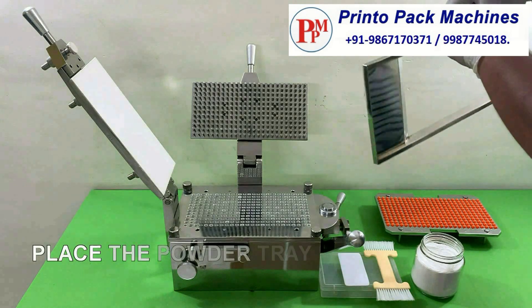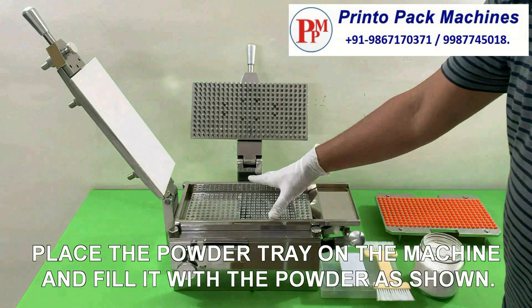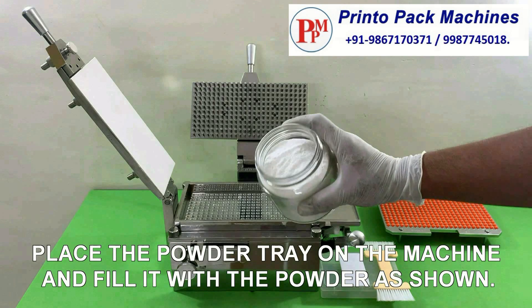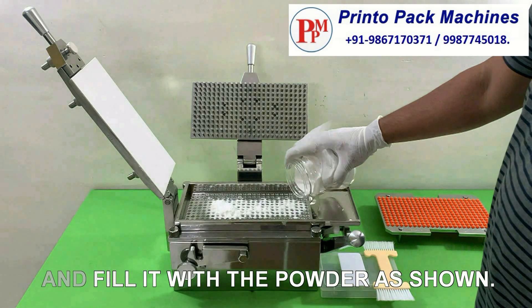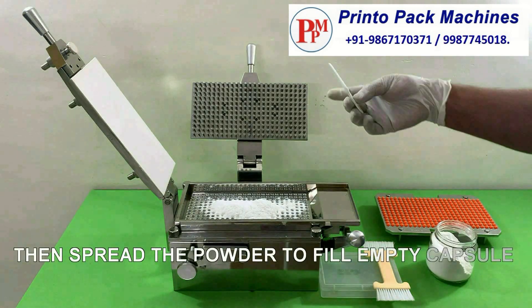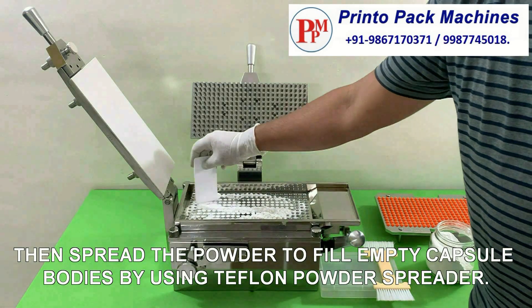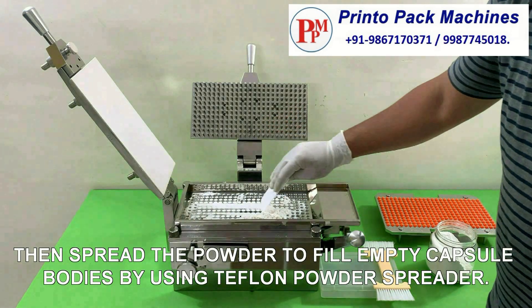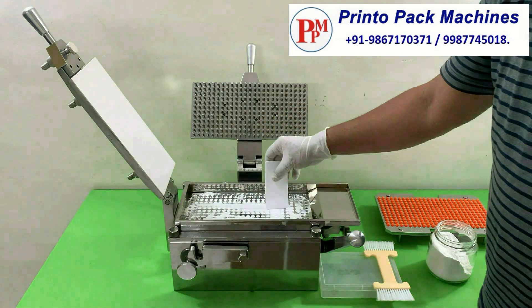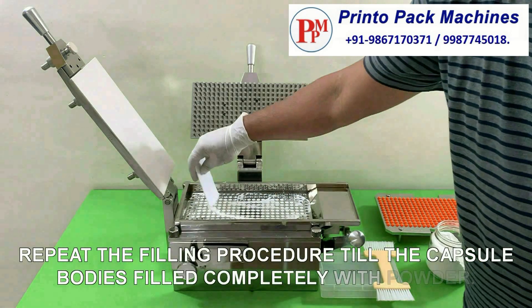Place the powder tray on the machine and fill it with the powder as shown. Then spread the powder to fill the empty capsule bodies by using the Teflon powder spreader. Repeat the filling procedure till the capsule body is filled completely with powder.